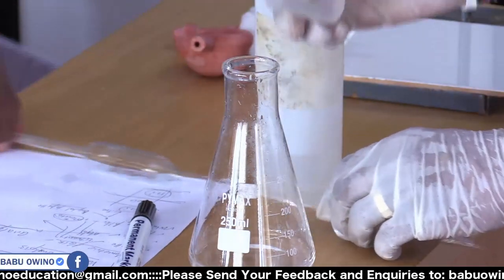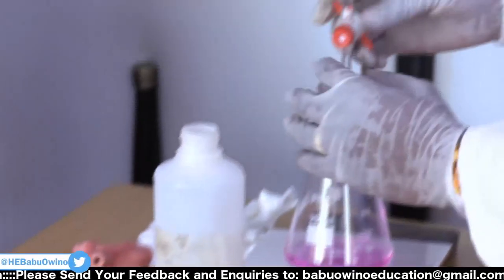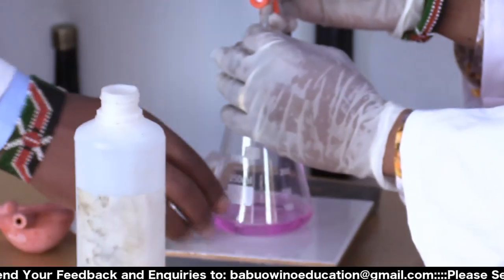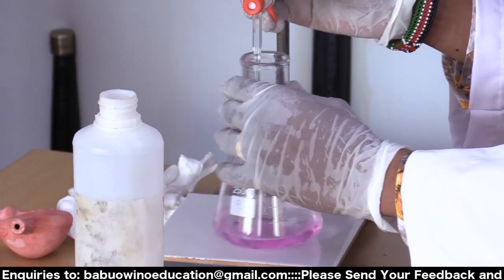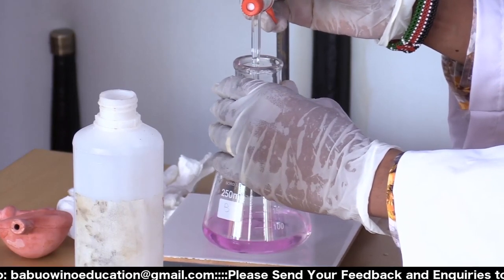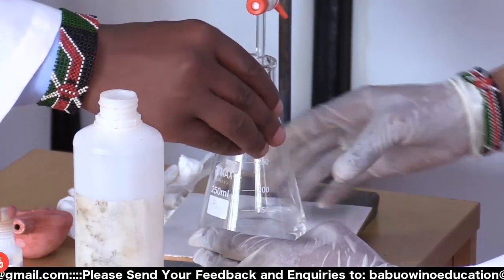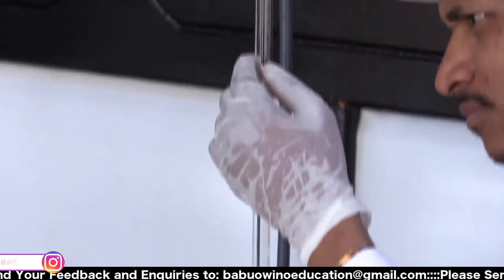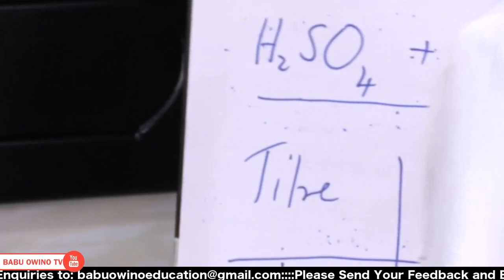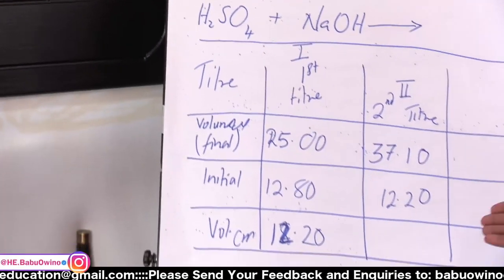Okay, then the indicator, 3 drops. Okay. Then we release it. Shake. Drop by drop. Okay. That's 37.1. You be careful as you read. 37.10. The second decimal point we said can be a 0 or a 5.